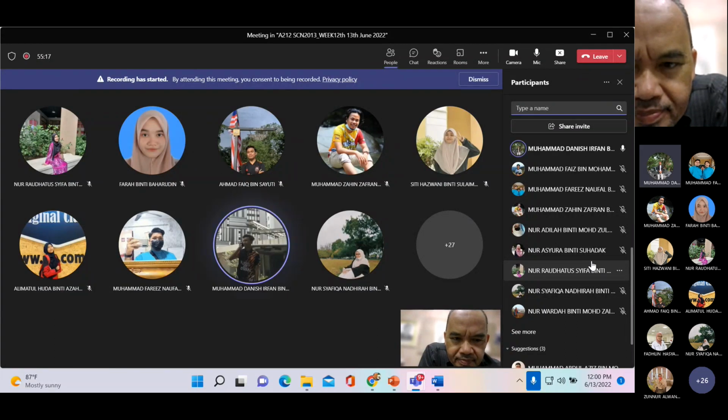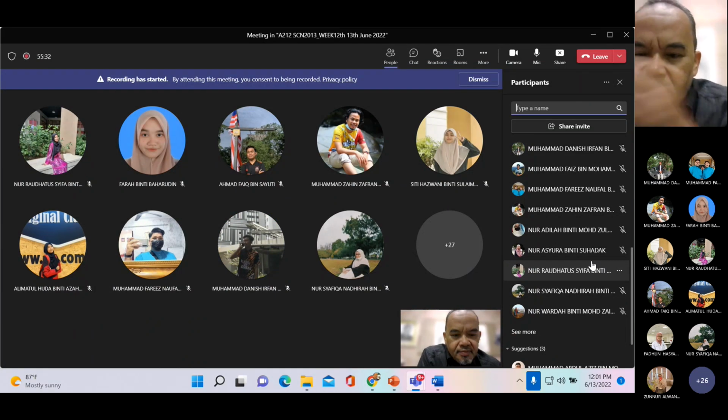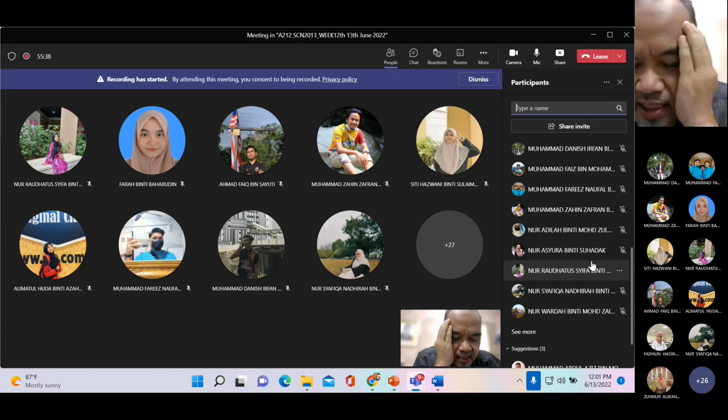Kalau macam quinine, dia aromatic. So, kalau nak bandingkan dengan H2O, H2O dia punya structure tak ada aromatic pun. So, that's the difference. Apa yang menyebabkan yang aromatic tu dia fluoresce? Air tu tak fluoresce. Jadi apa yang menyebabkan air tu tak fluoresce dan aromatic tu fluoresce?